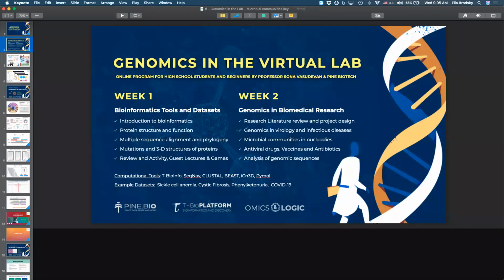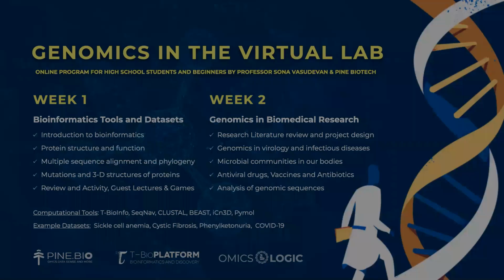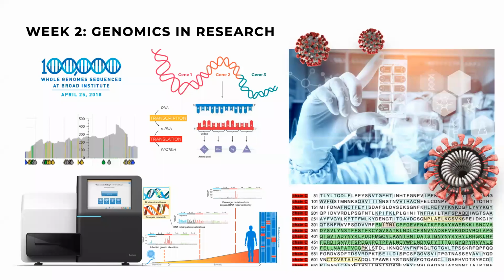This week we are talking about next generation sequencing and how it applies to different domains. We're going to talk about viruses and infectious diseases, and the fascinating world of the microbiome today. We'll do some hands-on tomorrow. We'll look at NCBI Virus and see how we can find interesting sequences and start comparing them. You also have a number of different practical examples that we will be discussing.